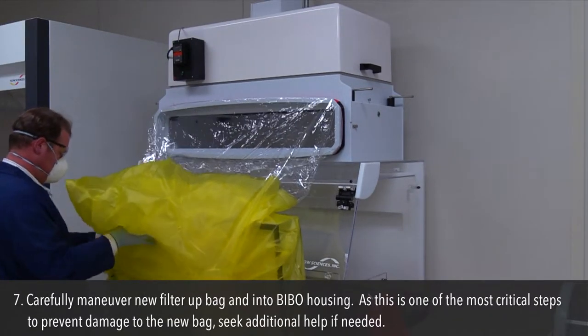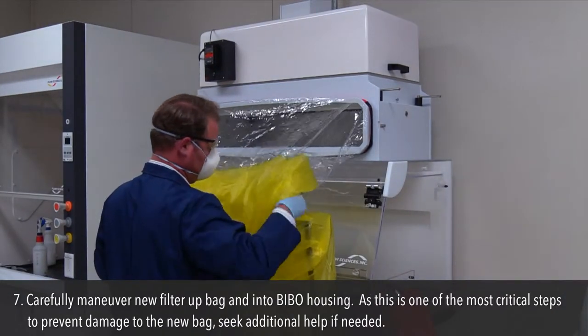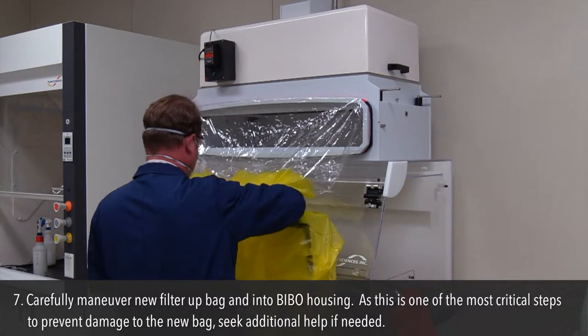Step 7: Carefully maneuver the new filter up the bag and into the BIBO housing. This is one of the most critical steps to prevent damage to the new bag. Seek additional help if needed.